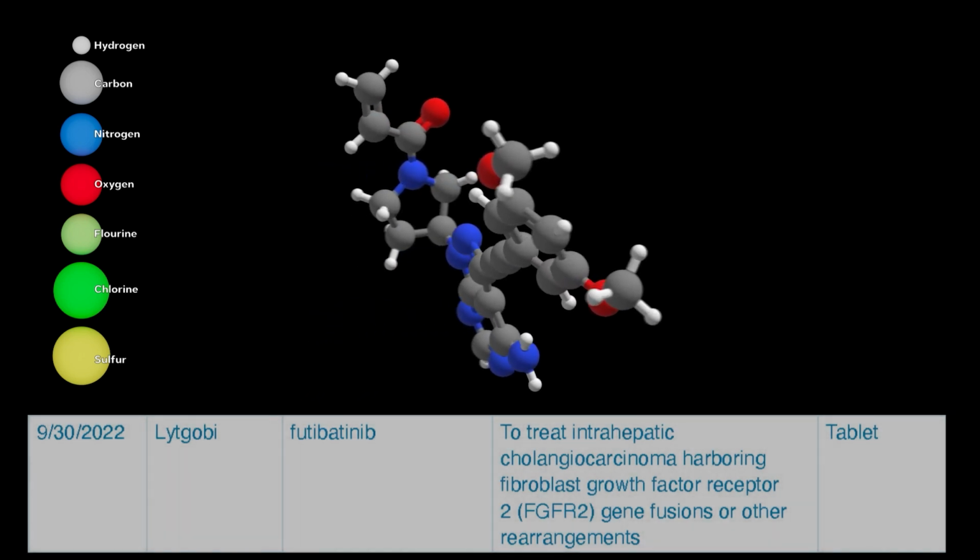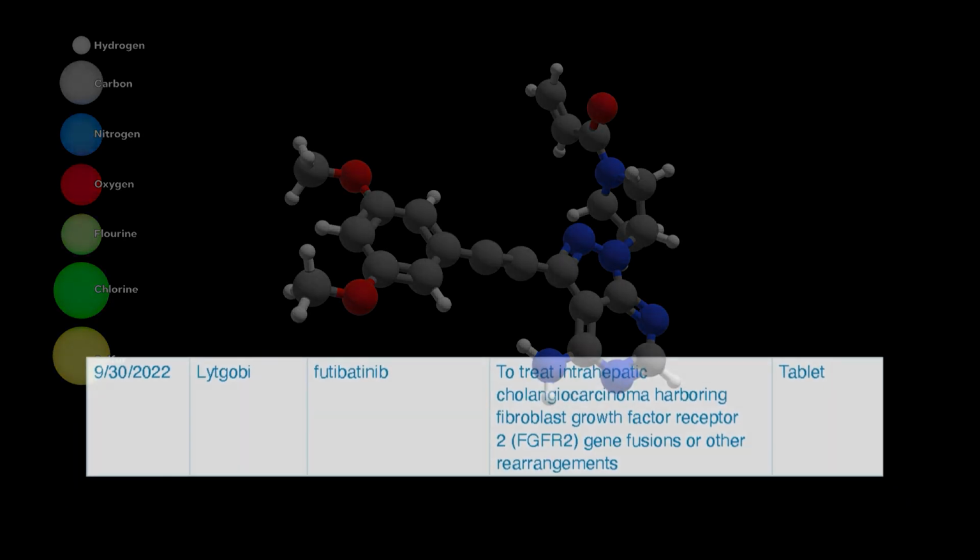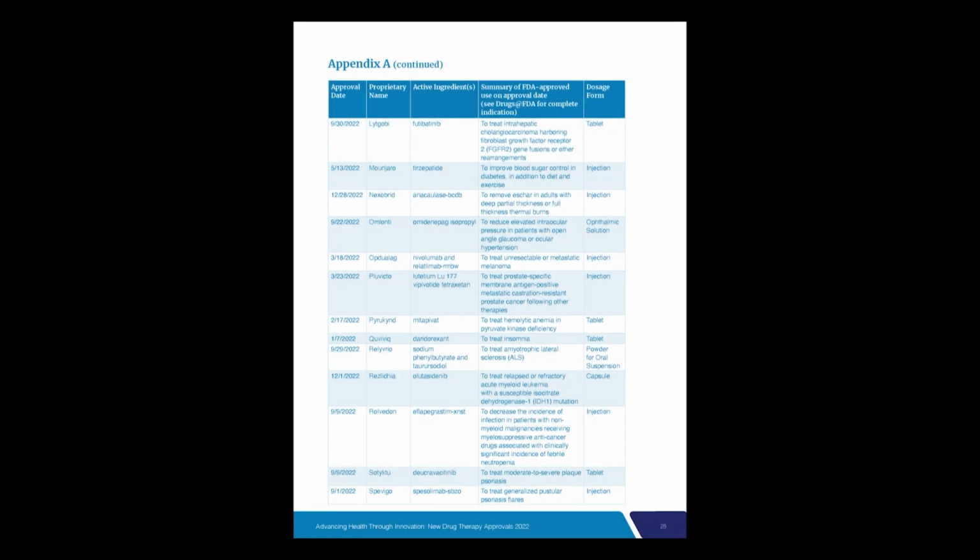Step 3. For quantitative analysis. HPLC is employed to quantify the concentration of drugs or their metabolites in biological samples during preclinical and clinical studies. This information is crucial for determining the pharmacokinetics and assessing the efficacy of drug candidates.